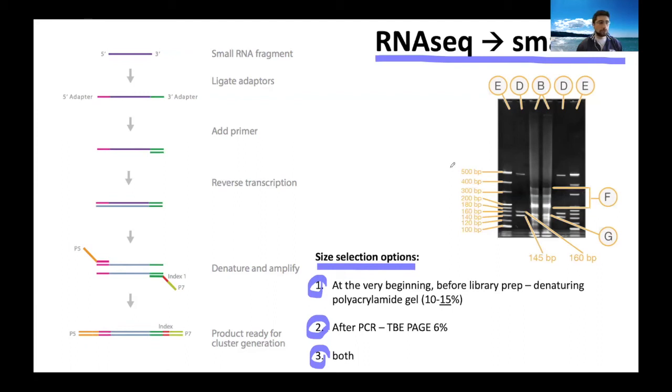Luckily for you, you don't need too many reads. We're talking about, let's say, 5 million reads for mammalian small RNA transcriptomes. And so even if you have a huge contamination of adapter dimers, you will not impact the sequencing costs a lot, okay?